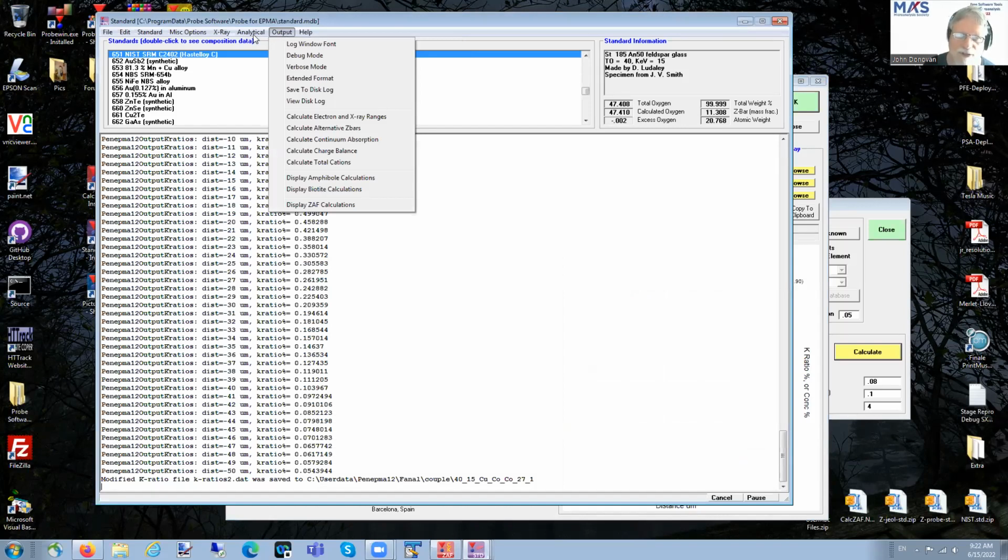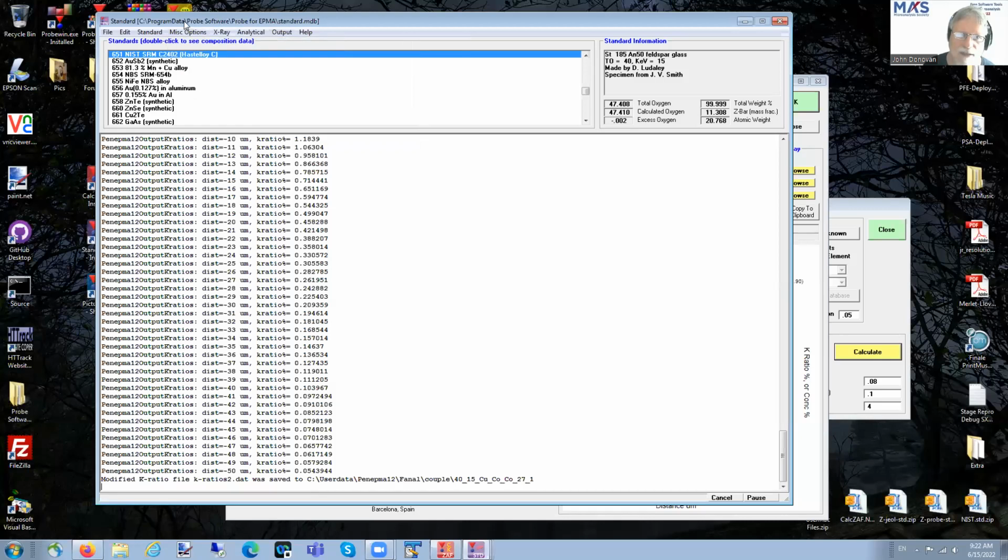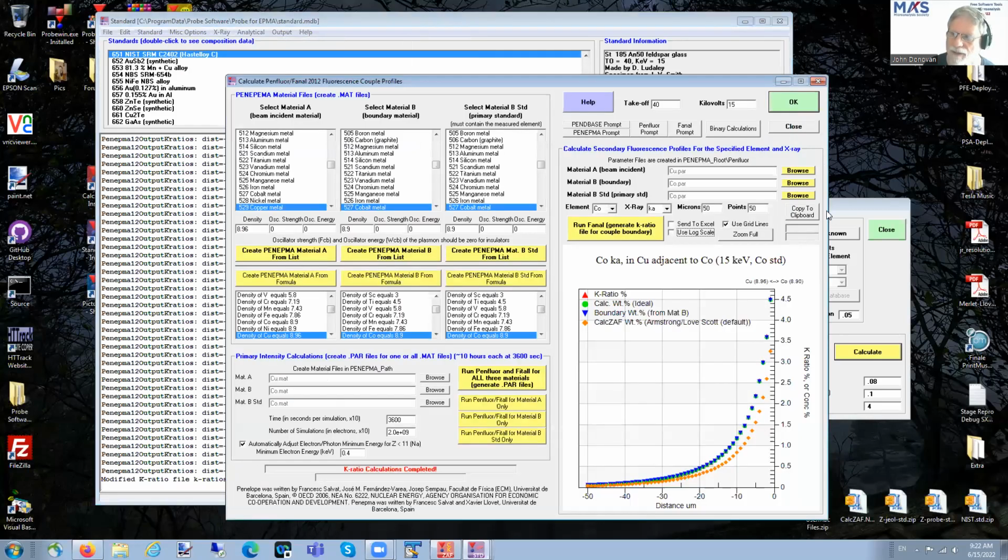There's lots of options here that I have not discussed, but the forum is a good place to learn about some of these. Post your questions on the forum or now, and I'll try to answer them. I'll leave a few minutes for some questions. Ed? Thank you, John.